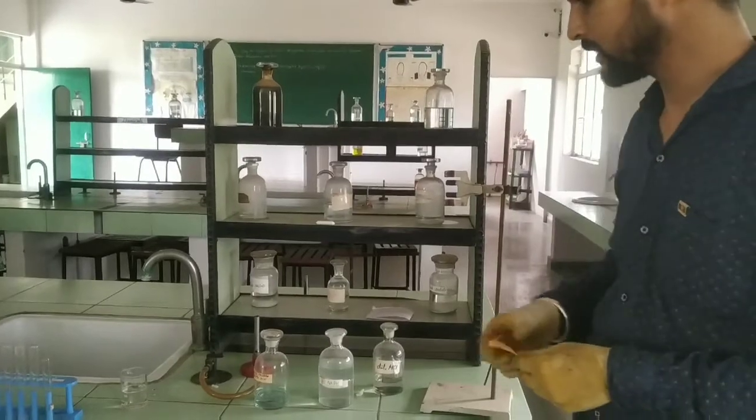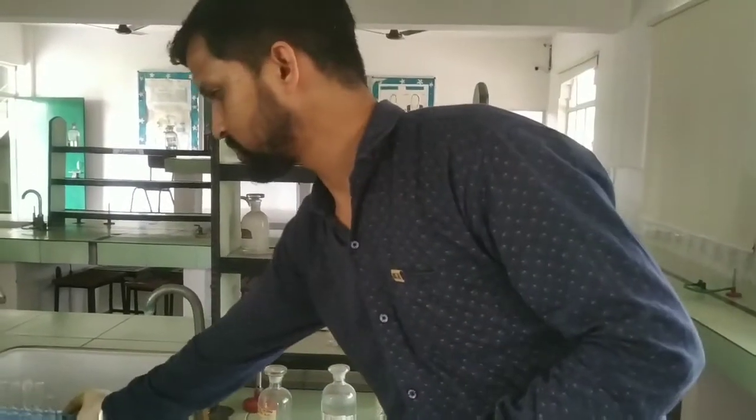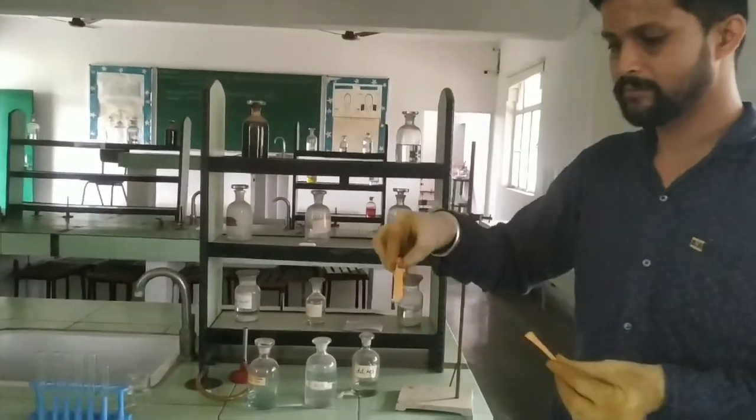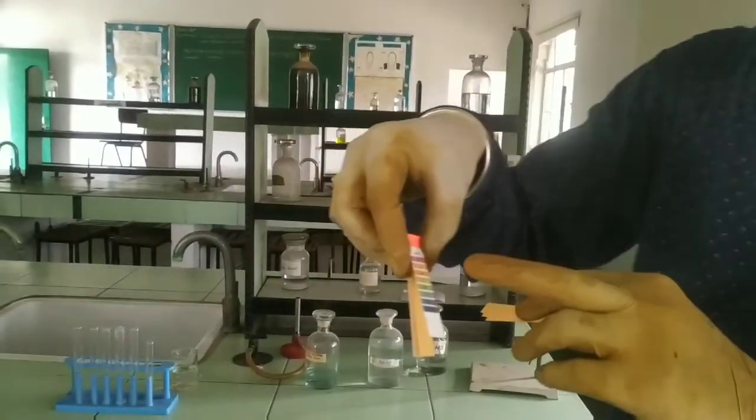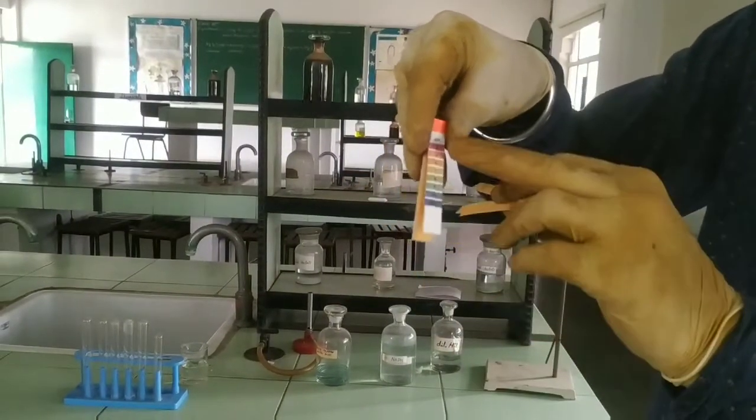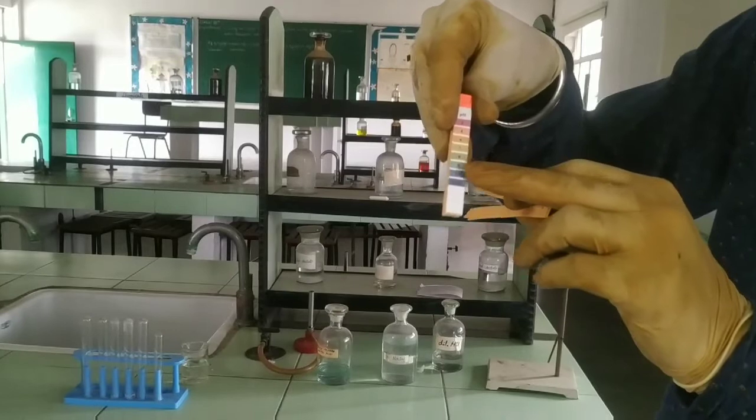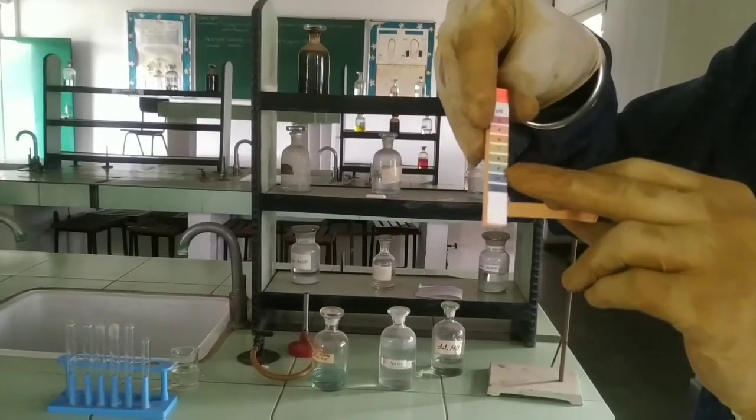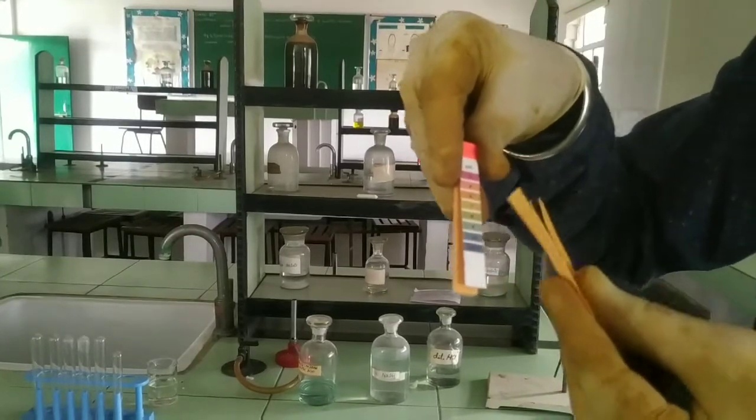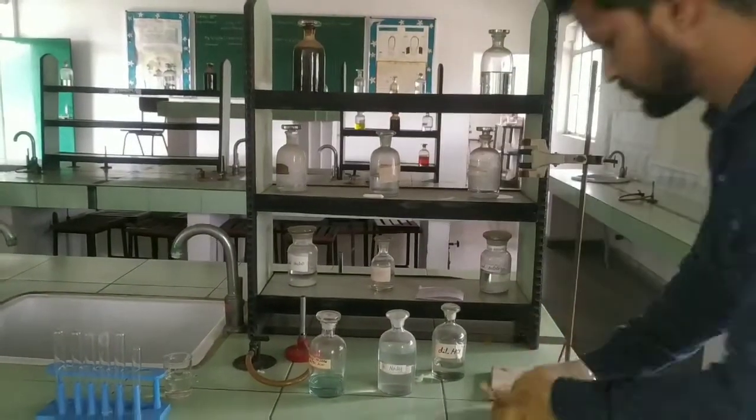Here we require the material: four test tubes and these pH papers which are used to calculate the pH. Here I have the pH paper and this is a table according to which we have to check the pH of the solution. Now I will show you the experiment with the dilute HCl.